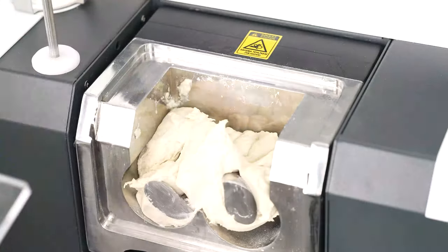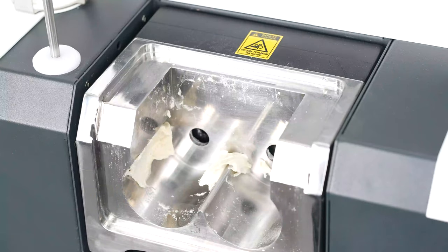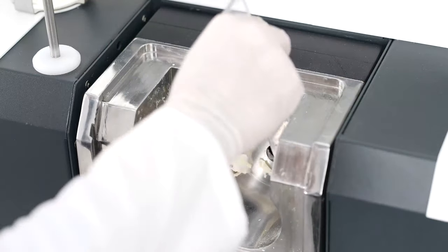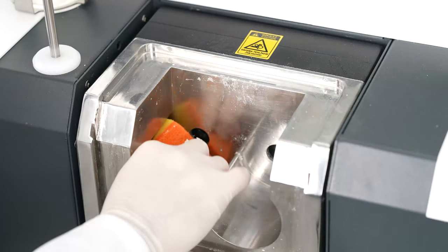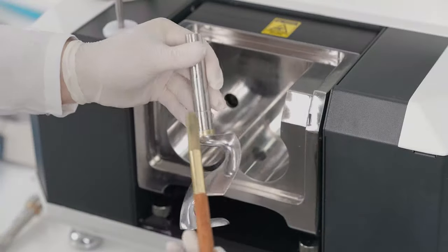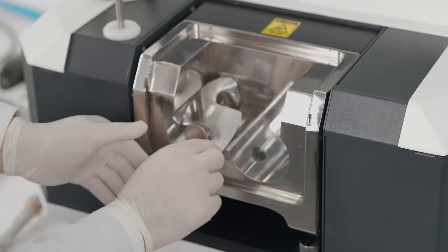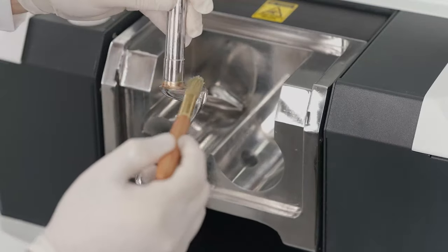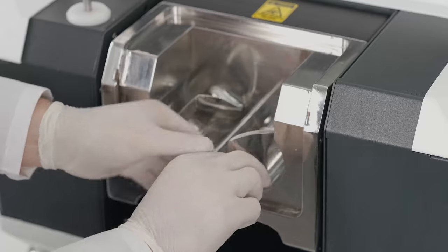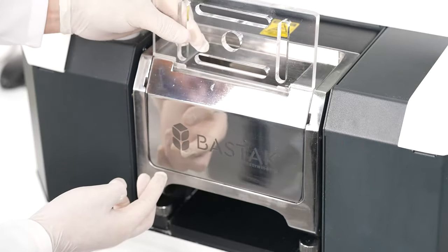After the test is completed, the kneading unit cover and kneading blades are removed. They are cleaned with a wet sponge and dried with a cloth. The kneading blades paraffinized with liquid paraffin are inserted into their slots, and the kneading unit is made ready for the next analysis by attaching the unit cover.